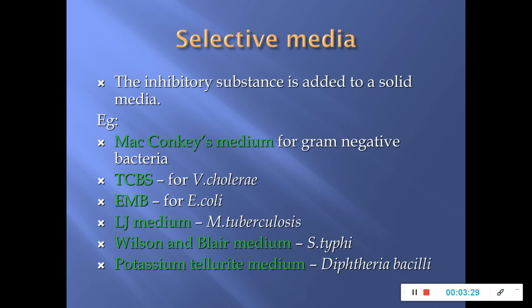Now, something which we have to know is that these are not the only specific media which are available. Every organism can have different types of selective media. So based upon the availability of selective media, as well as what is considered to be a standard media, you can use different media for the same organism.